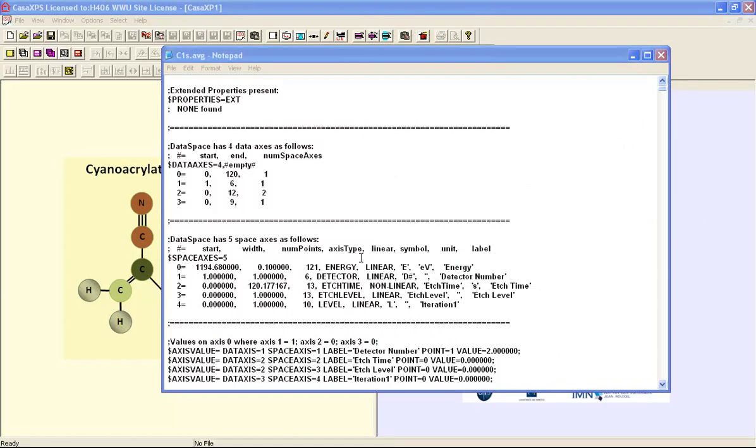For an ordinary measurement of spectra that involves a scan of energy and etch times, then the AVG file conversion filter would work.